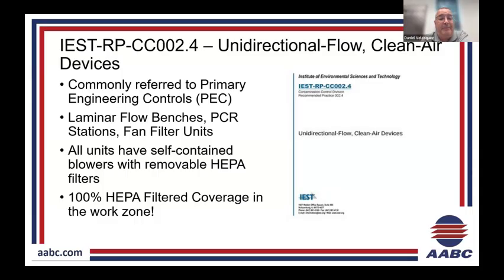So, good examples of that you may see in the industry: laminar flow benches, clean rooms, anything with production and filling lines. They'll have them. Hospital pharmacies use them for compounding. PCR stations, you'll see those a lot. And this also includes fan filter units. You may see them mounted in ceilings. You may see them mounted as a little isolation or a little clean booth in production areas as well.